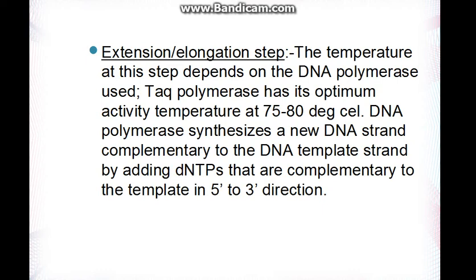So we will raise again the temperature to 72 degrees Celsius, and now what will it do? It will synthesize a new DNA strand with the help of the nucleotides we are adding. It will synthesize a new DNA template strand, and the addition will always be in the direction of 5' to 3'. Okay.